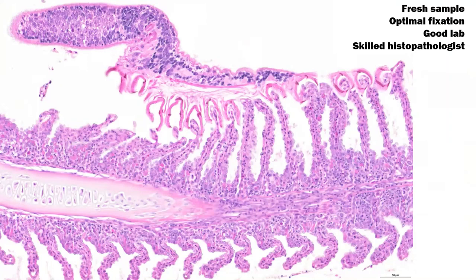And so I would like to stress a few points before passing to the other part of my speech, especially for the technicians or vets who work in a fish farm, who collect the samples that then have to be evaluated by histopathology. It's necessary to have fresh samples, optimal fixation, a good lab, and skilled histopathology to obtain the perfect results using histology.